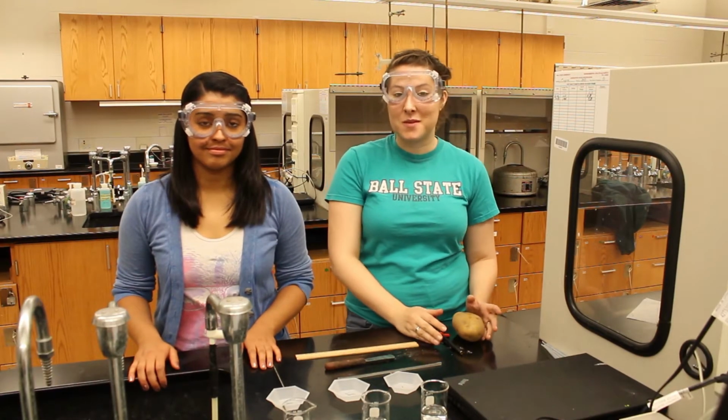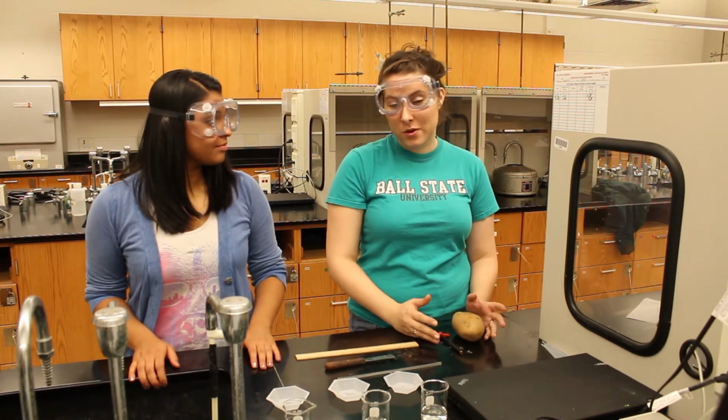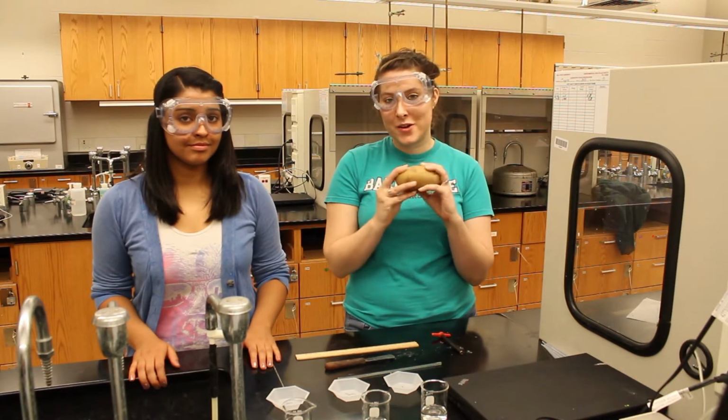As you know, solutions are made up of two things, a solute and a solvent. Now, in today's lab, we'll be exploring the properties of both using a potato.